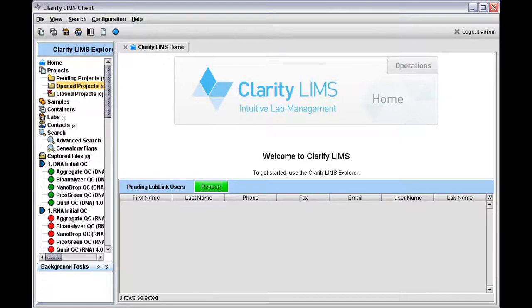Hello, in this video I wanted to demonstrate some of the approaches that we use and recommend as a best practice for interacting with a bar coding solution such as BarTender Commander. And for this little demo and demonstration I'll be using Clarity LIMS 2.